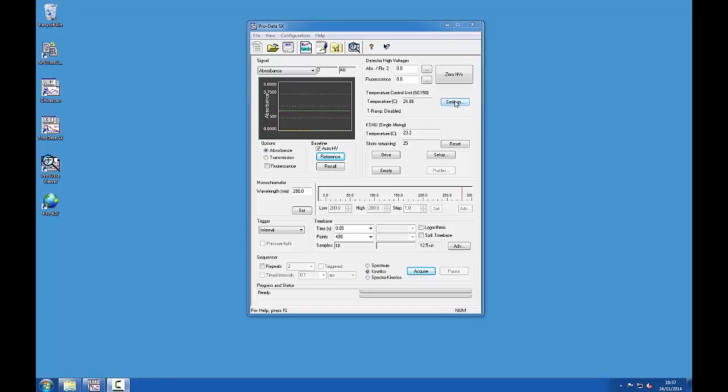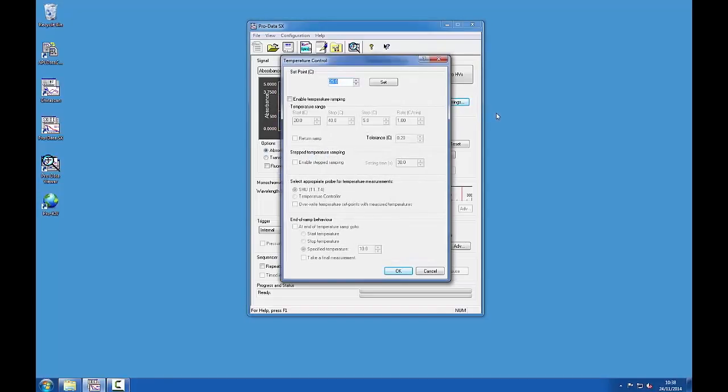Often we wish to control the temperature at which we make our measurements. To do this, turn on the circulator and set the desired temperature. For particular circulators, this can be done within the ProData software.